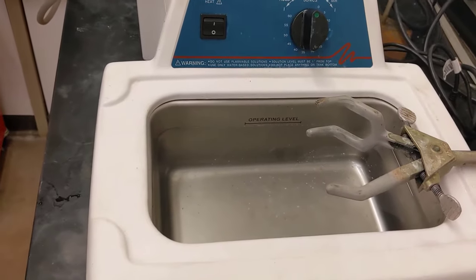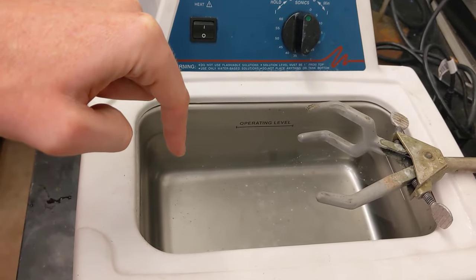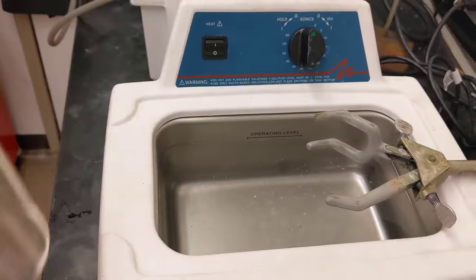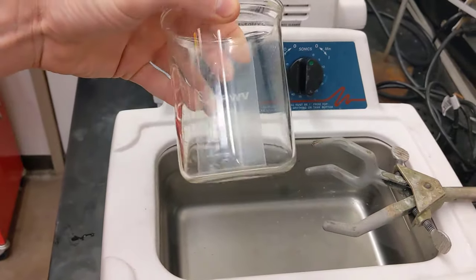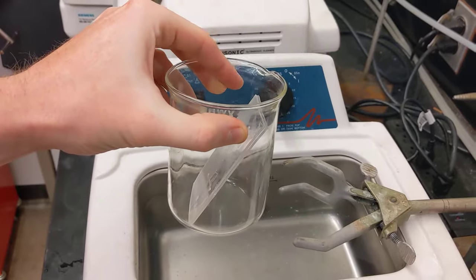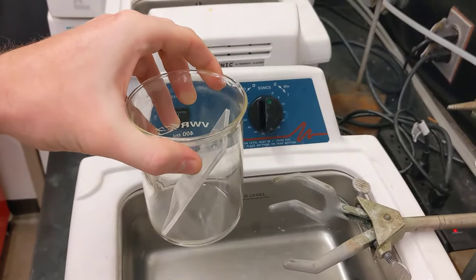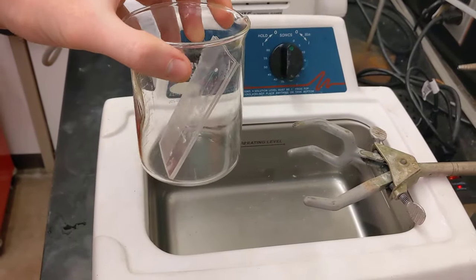Most often for our applications, you don't want to use the water itself. This is simply another transduction mechanism to whatever vessel you want to clean in. Say you want to clean this chip here — you're going to use another beaker, which allows you to have a clean solvent or water inside, separate from this dirty bath and without requiring so much volume of liquid.